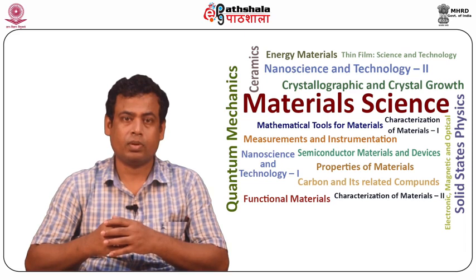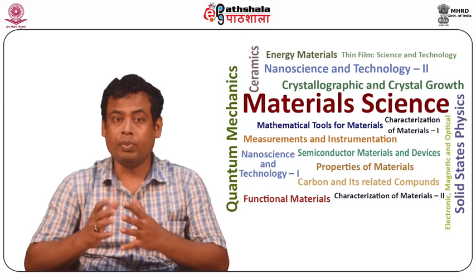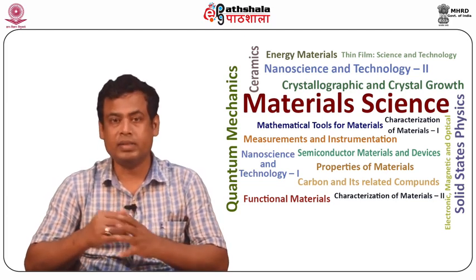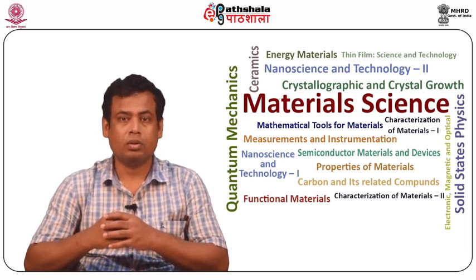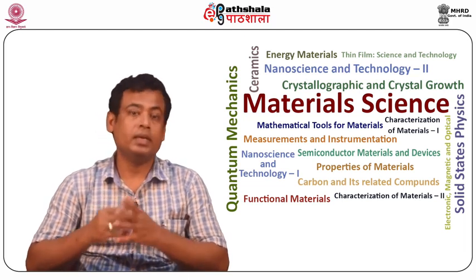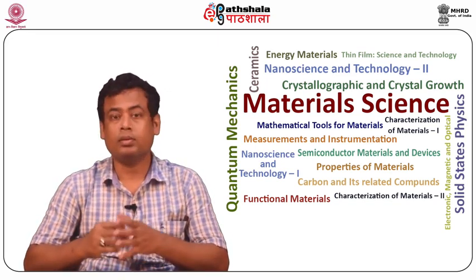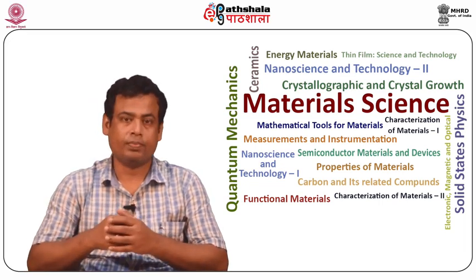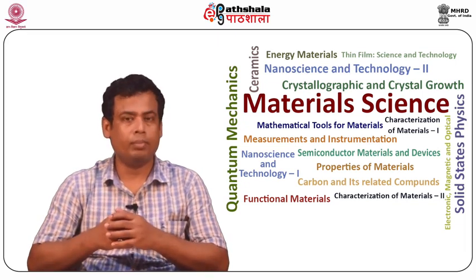The AES instrument is capable of generating depth profiles of the surface layer going towards the inner layers of bulk materials and reveals the spectral distributions of elements on the surface of the bulk material.